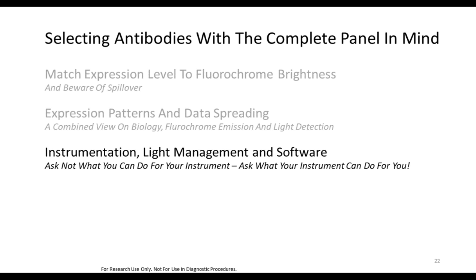So the next part of the talk, we're going to focus on the instrumentation and how instruments are responsible for managing light, and also where the software is important for not only controlling the instrument, but for providing tools that can also facilitate your workflow.